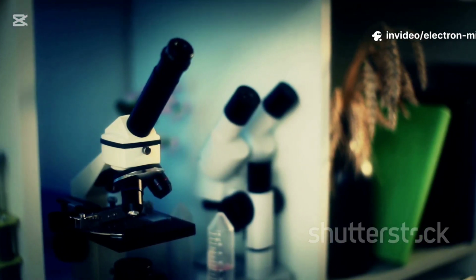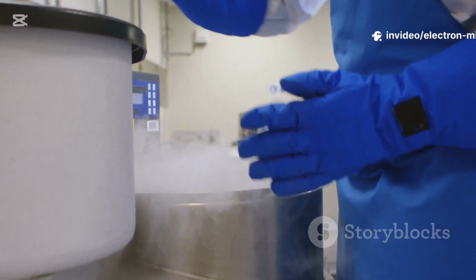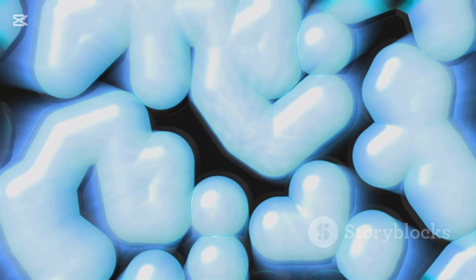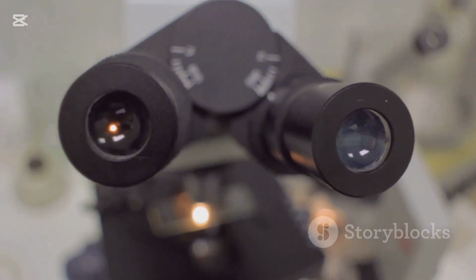Faced with barriers, we invent new ways to see. Cryo-EM freezes life in its native state, while better detectors and smarter software extract more from every electron. The frontier of the small is as vast as the large. In molecules and cells, countless discoveries remain. So look at your hand and wonder, what else will we find?